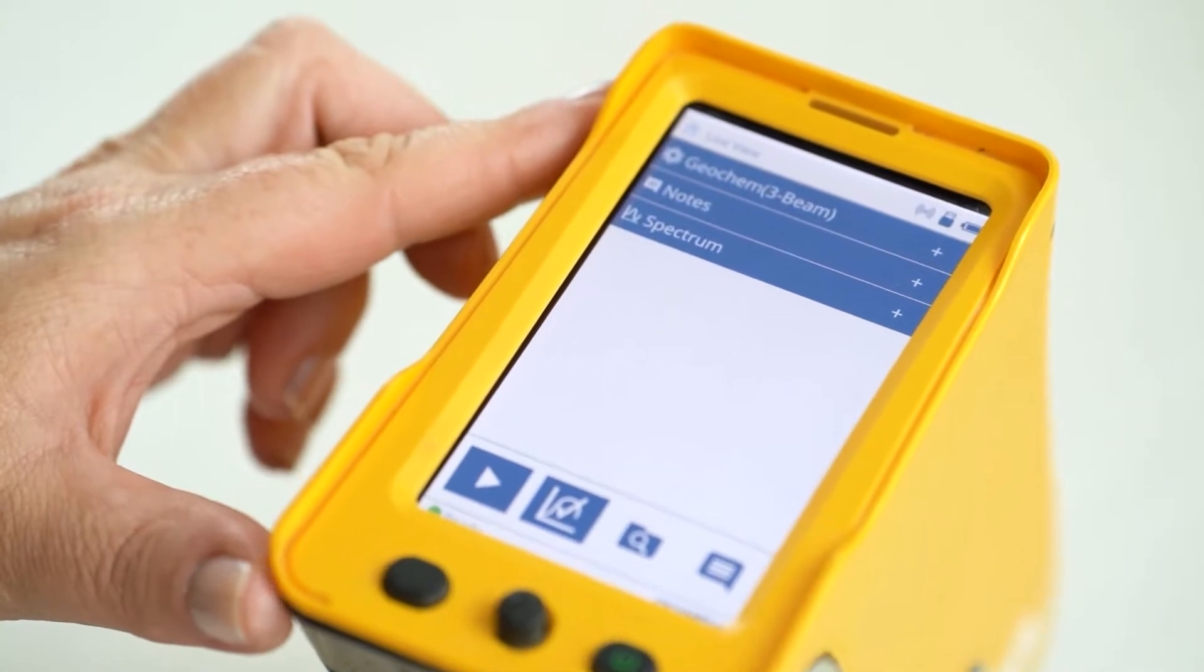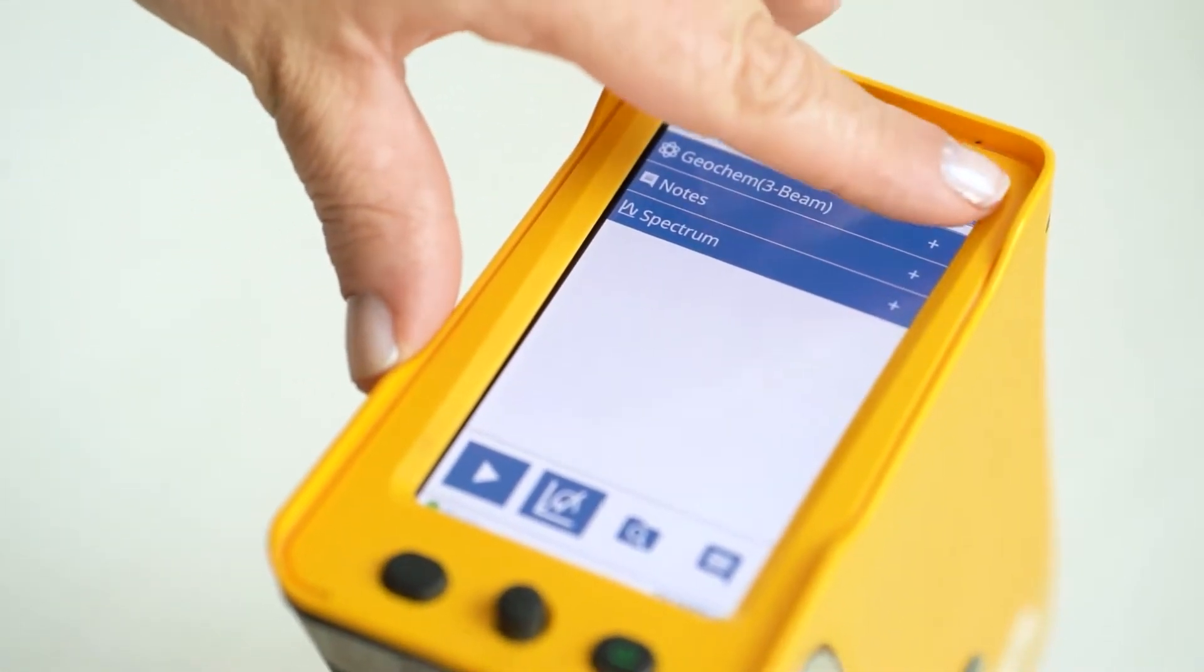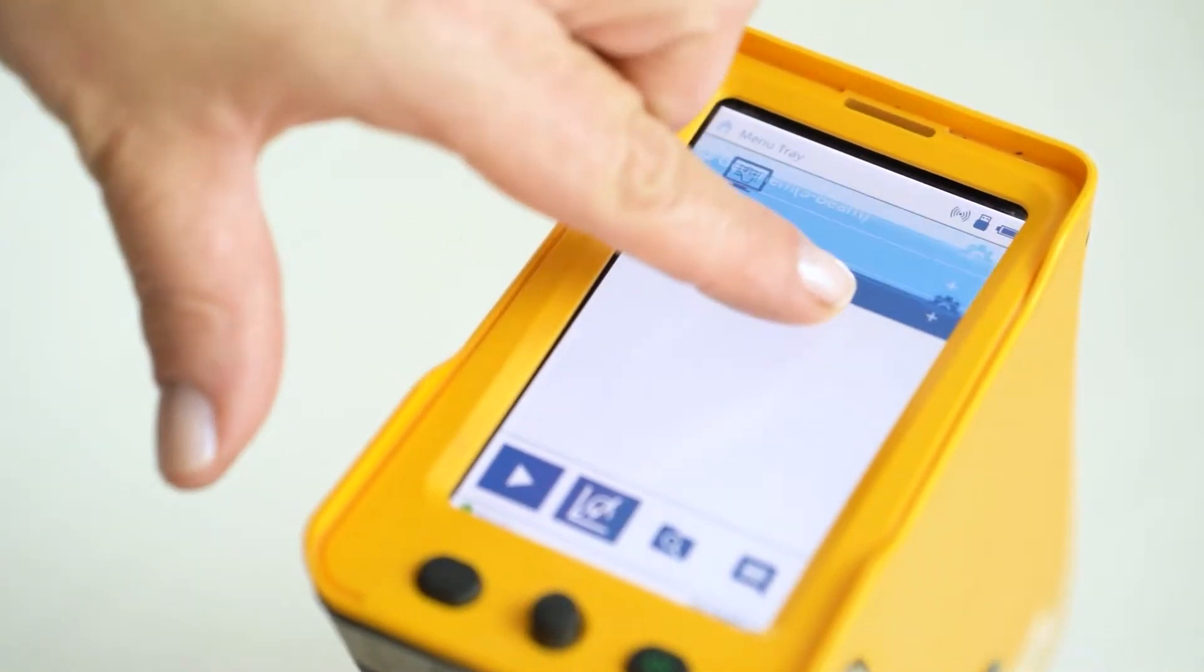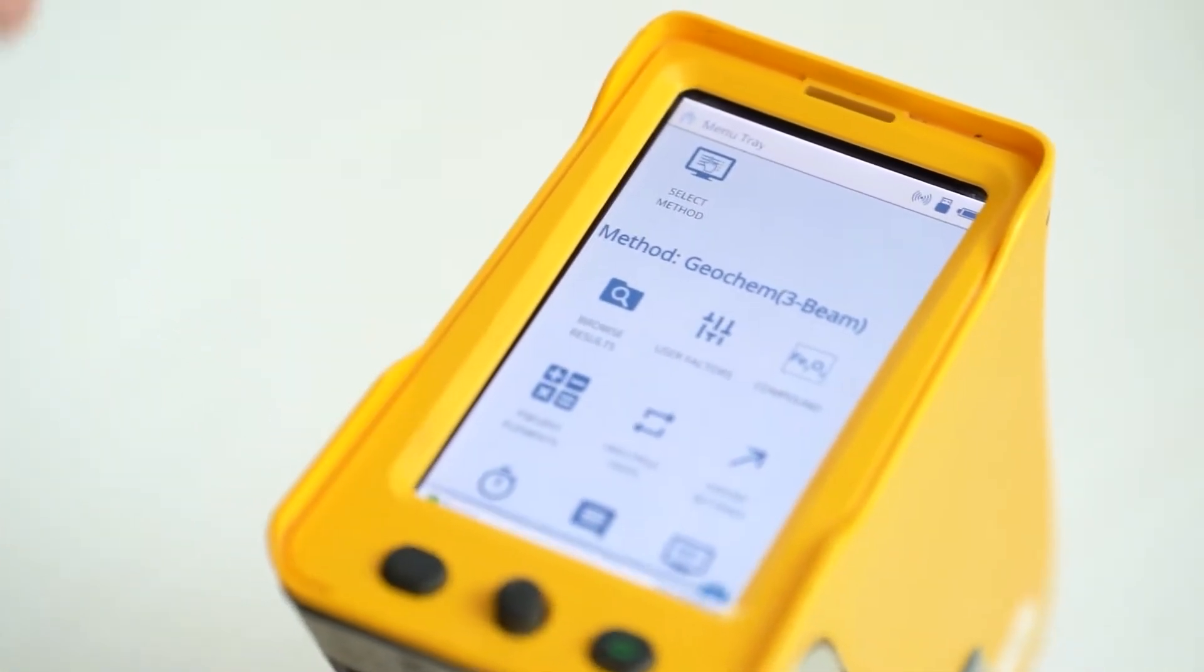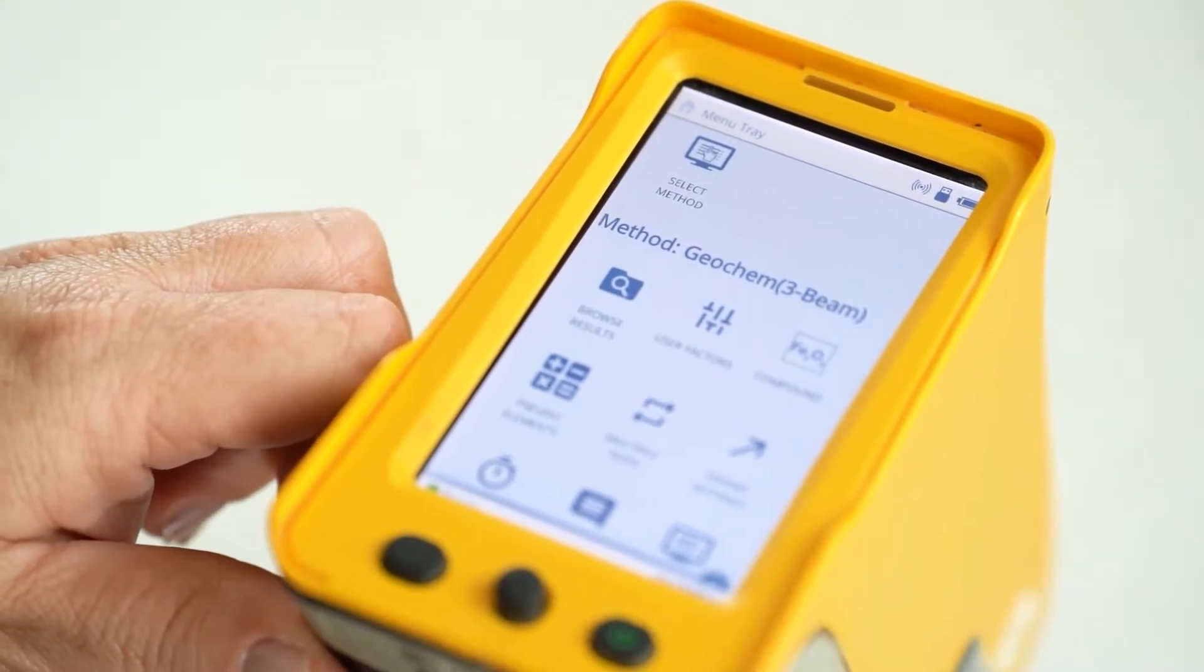Now you want to drag the screen diagonally from the top right hand corner down to get to the menu settings.